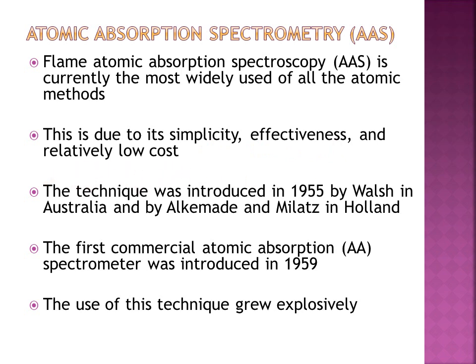This technique was introduced in 1955 by Walsh in Australia and by Alkemade and Milatz in Holland. The first commercial atomic absorption spectrometer was introduced in 1959, and then this technique grew explosively.